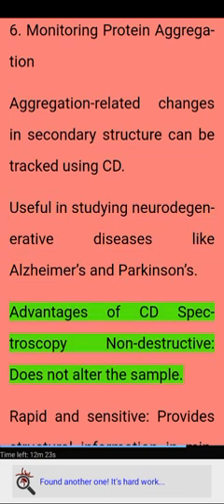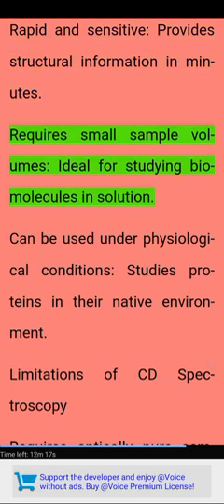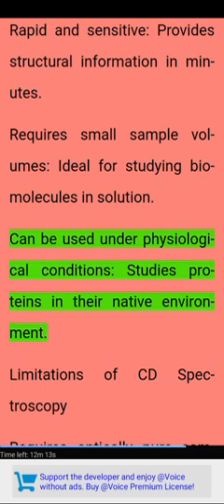Advantages of CD spectroscopy: non-destructive, does not alter the sample. Rapid and sensitive, provides structural information in minutes. Requires small sample volumes, ideal for studying biomolecules in solution. Can be used under physiological conditions, studies proteins in their native environment.